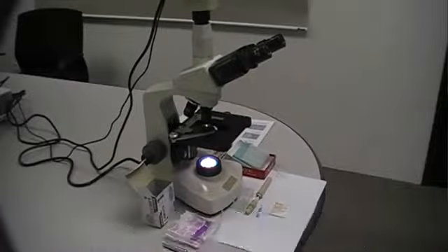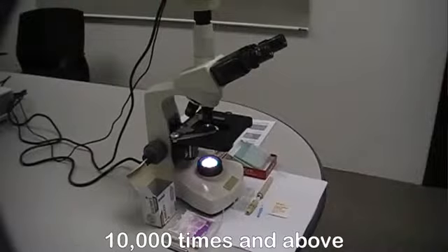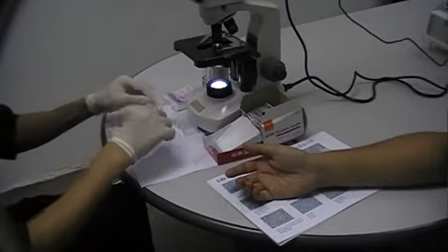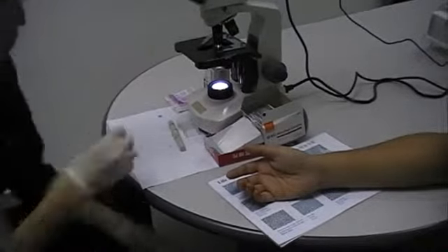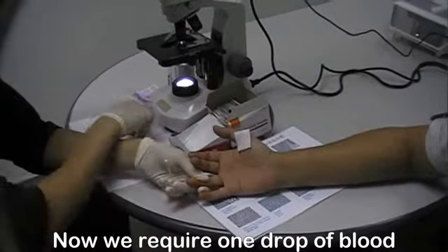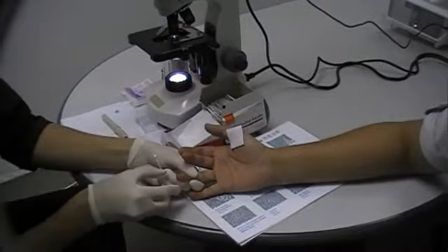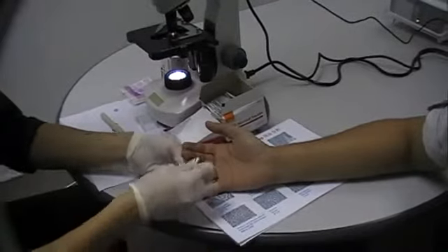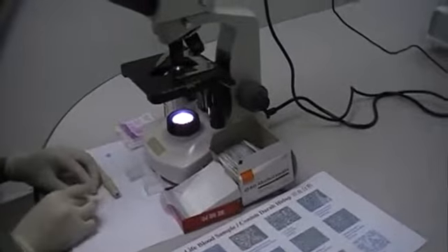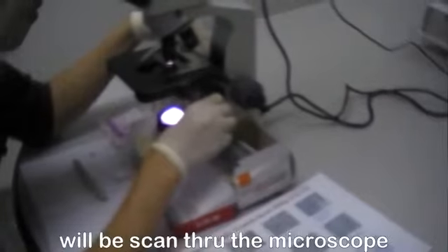This is a microscope which can be used to analyze and check the live blood. It can be used to view the red blood cells by magnifying it 10,000 times and above. We require one drop of blood. The microscope is used to analyze the live blood, and the result of the live blood will be scanned through the microscope.